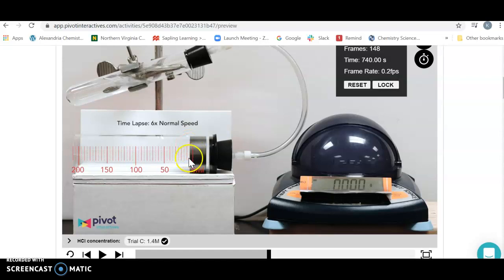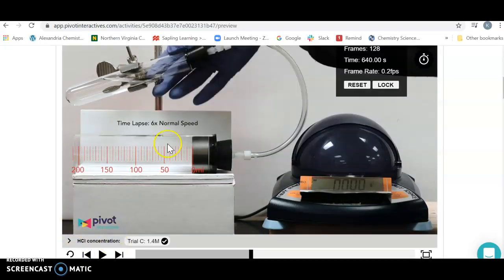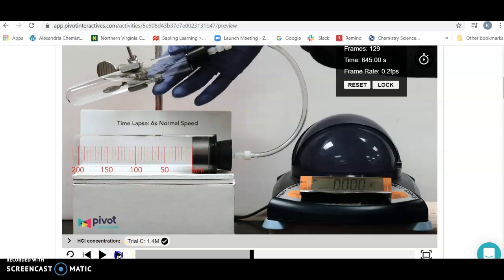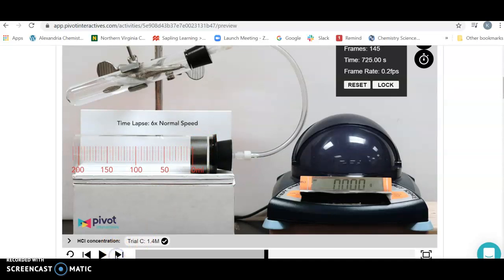We're going to figure out how long it takes to make 15 milliliters, starting at a volume of 5 mils and going to 20. To control this in a finer manner, this is a short step back. Sometimes it takes a while for it to move. As you play, you might have to press this slowly until the hydrogen starts going in and the plunger starts to move. Keep moving it until it hits 5 mils.